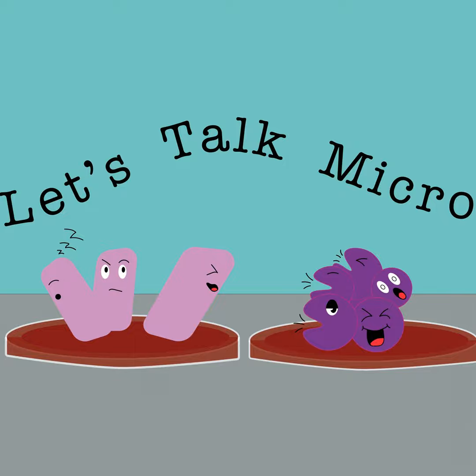So what if this person doesn't know what they're looking at? You give them a plate, you write on your plate, moldy, and then they don't know the organism that they're supposed to set up. They set up the wrong one. And then the person accepting the ID might be you, or you might have some help, and maybe that person doesn't know what they're looking at either. So they accept the wrong ID. Then you release that wrong ID, and the patient might get put on the wrong treatment.